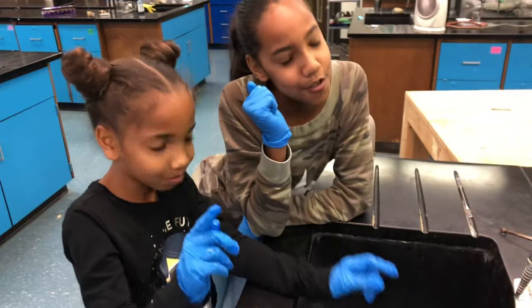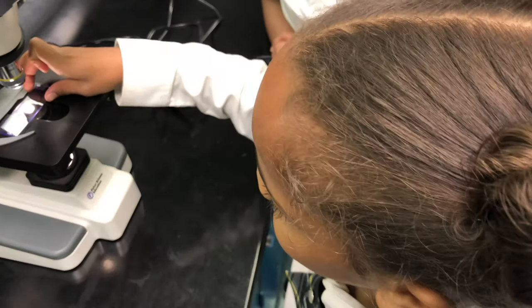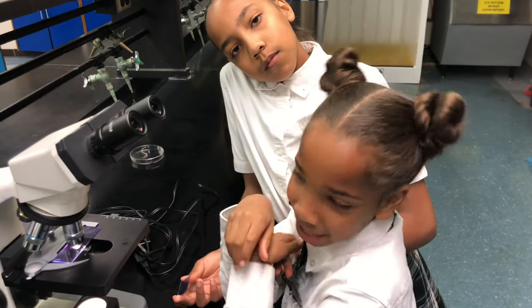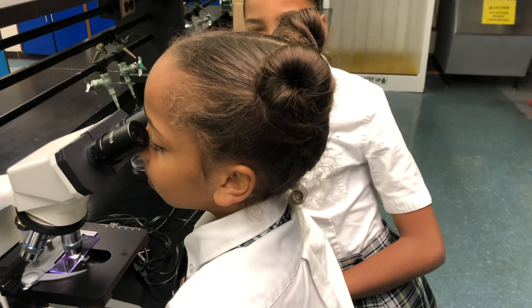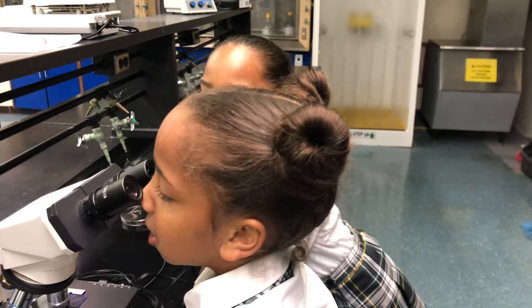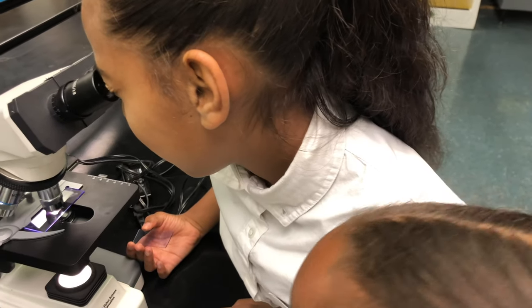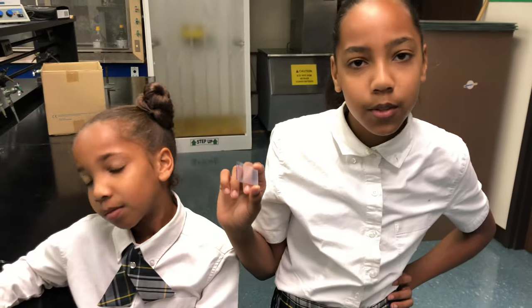Now we're gonna rinse it off, then dry it and look at it under a microscope. My mom focused the slide and I'm gonna look at it — it was focused under oil immersion. You see it? Yeah, that looks like staph! Those are clusters of grape-looking cells, guys. I'm not surprised because that plate grows halophiles like staph.